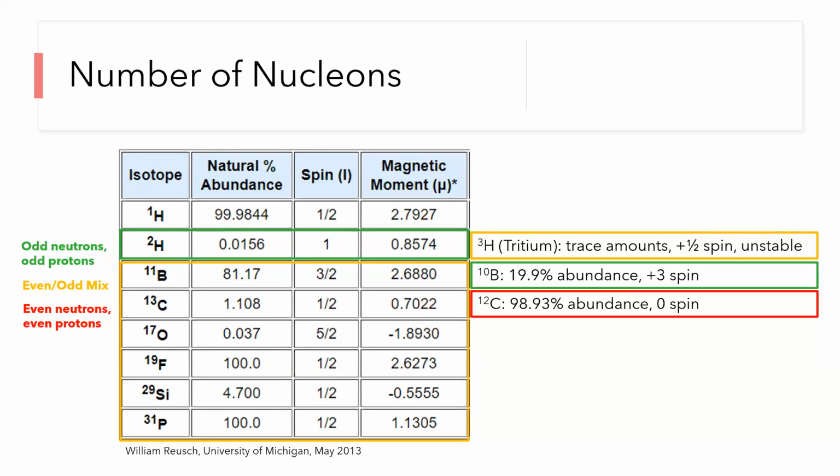But one strength of NMR is when we can use hydrogen, because the isotope of hydrogen that's useful is 99.98% abundant. And the other, hydrogen 2, is also useful, but it's not as abundant. But this is very useful for doing NMR spectroscopy on polymers, because polymers have a lot of hydrogen. So this is one excellent strength of NMR, that we can do NMR on polymers. They have a lot of hydrogen.